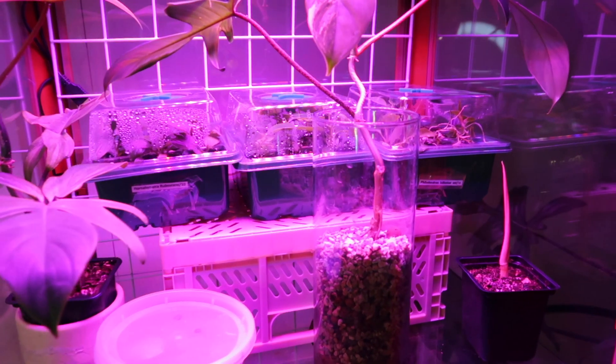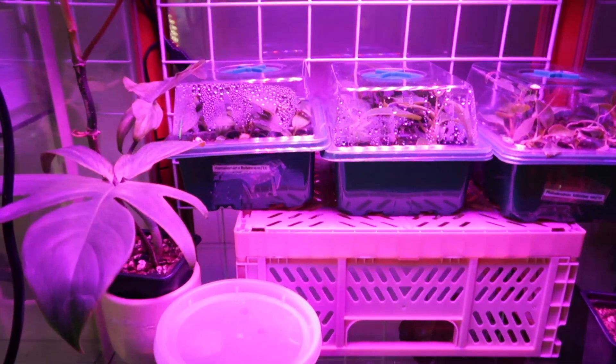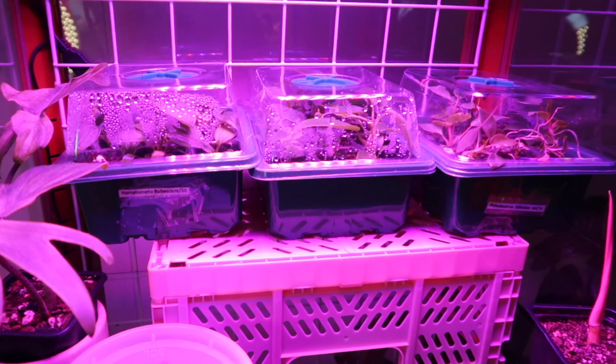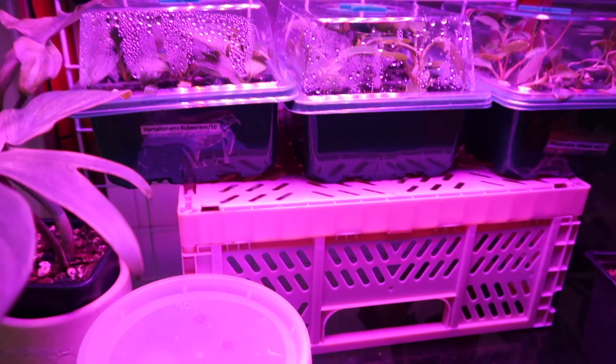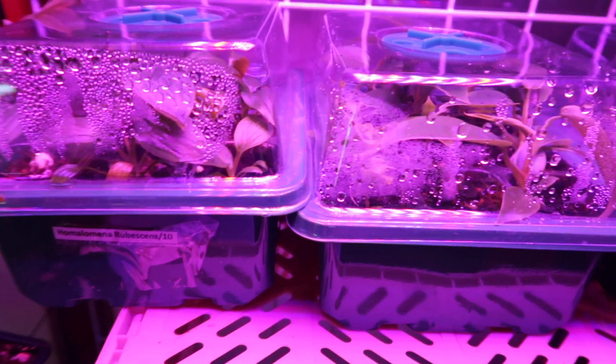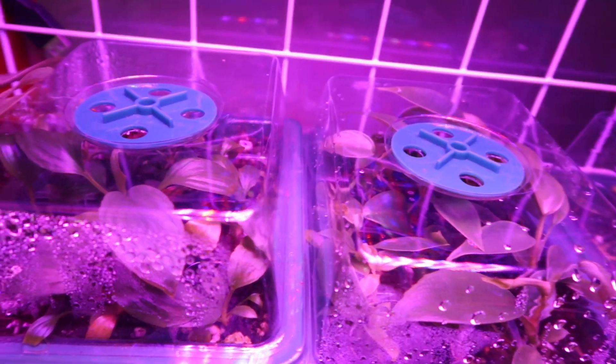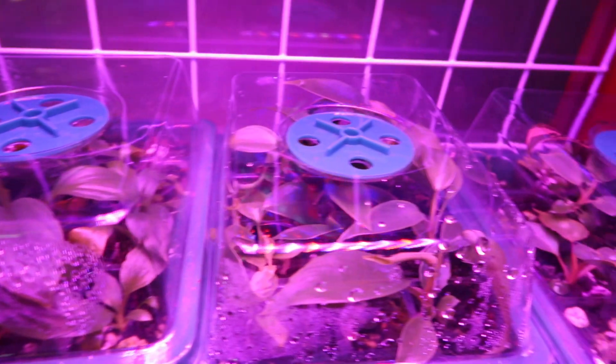I moved the tissue cultures into this cabinet because of the grow light. If you watched my previous video when I was working on the IKEA cabinet, I went through the different types of grow lights you can have, and I really wanted my plants to root very well. And as you can see, they are growing and thriving. I'm going to go ahead and take them out of the cabinet so you guys can see what's been going on.